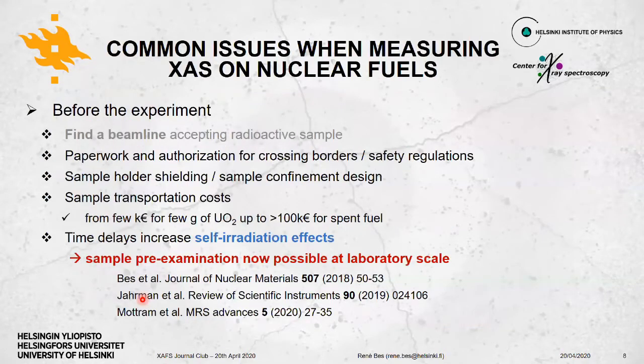So then you have the beamline and you have to deal with a lot of paperwork in order to have the possibility to bring your samples there. For those who are used to bringing additional samples into the beamline, it is impossible in the case of such samples because every milligram of sample has to be declared beforehand, and special transportation has to be considered. So if the experiment is not going well, we are losing beam time, actually.